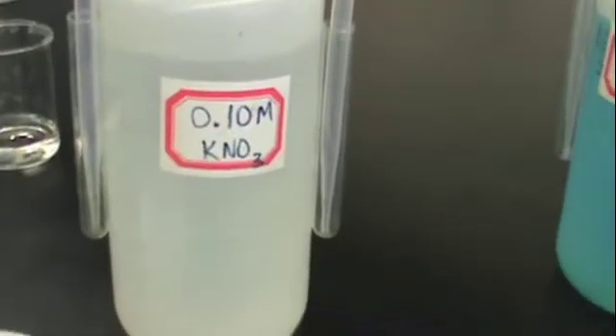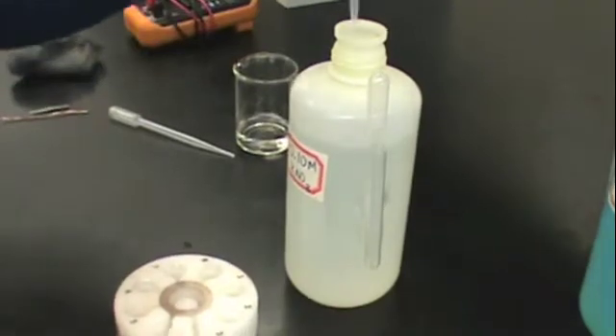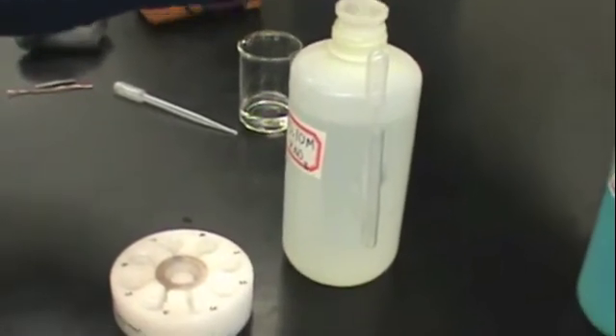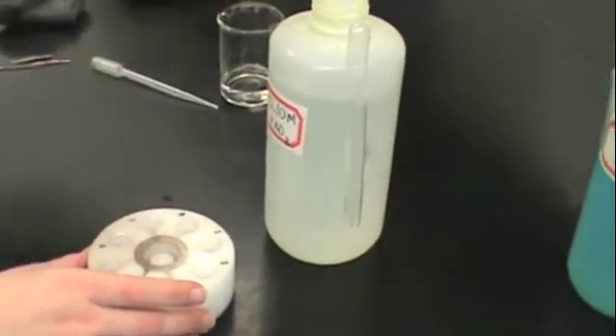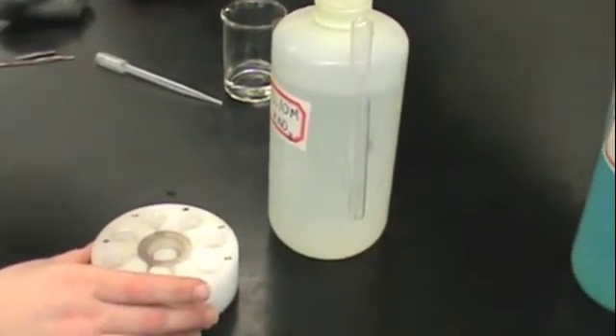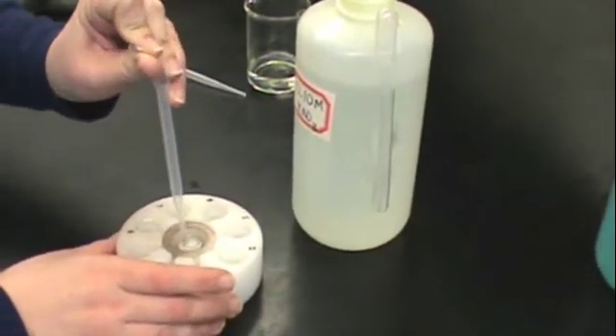In this part, we will show you how to prepare your copper and zinc half-cells. Obtain KNO3 solution and pour this into the central well — this will be our salt bridge. Make sure that this well is filled almost to the top so that it provides a good connection for the other wells.